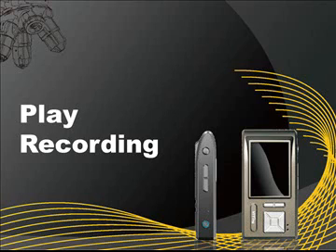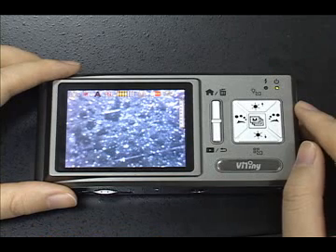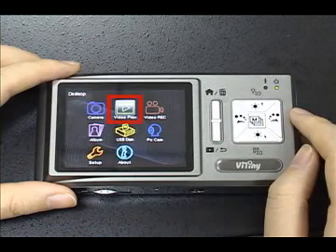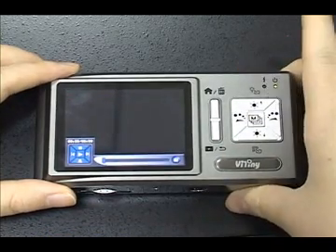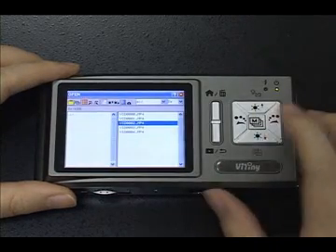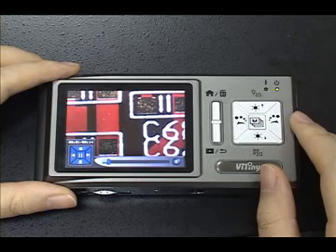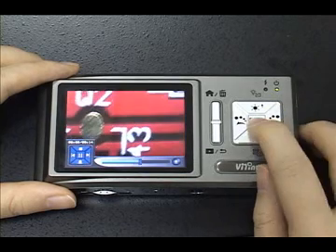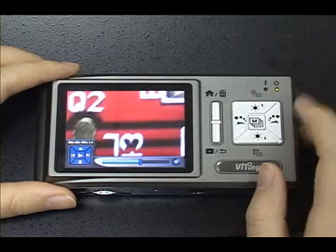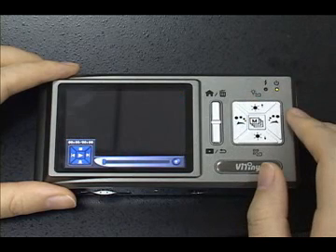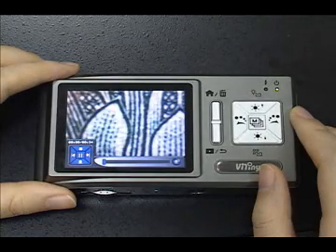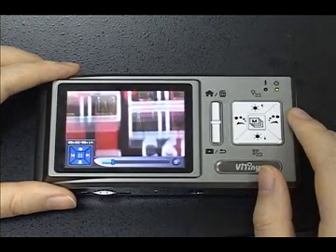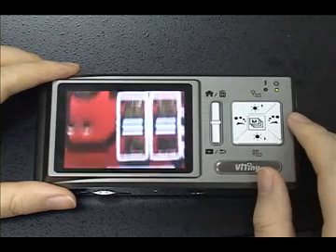Play recording: select Video Play and press the middle button, then press the snapshot button to enter the chapter. Choose the video file you want to play. Press the bottom middle button to pause, the bottom up button to stop, the bottom right button to play the next file, the bottom left button to play the previous file, and the bottom button to hide the control panel.